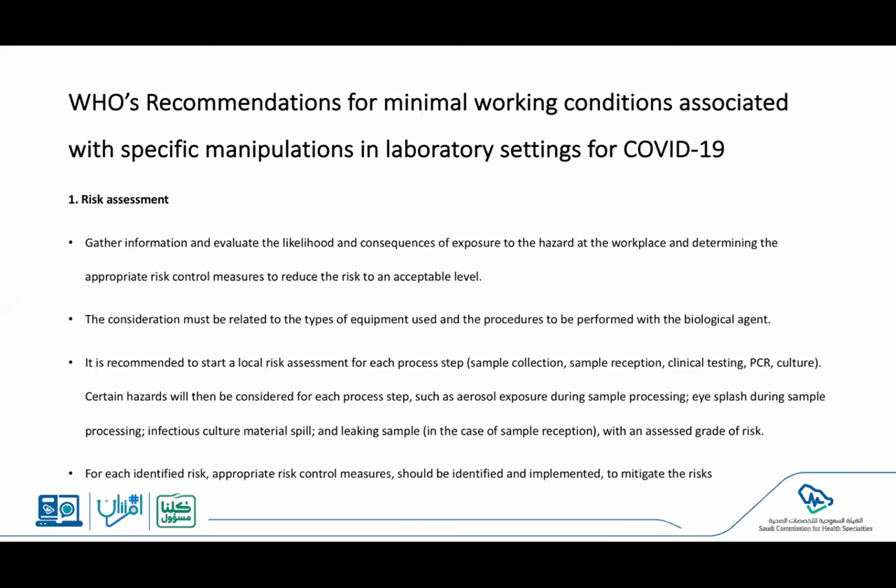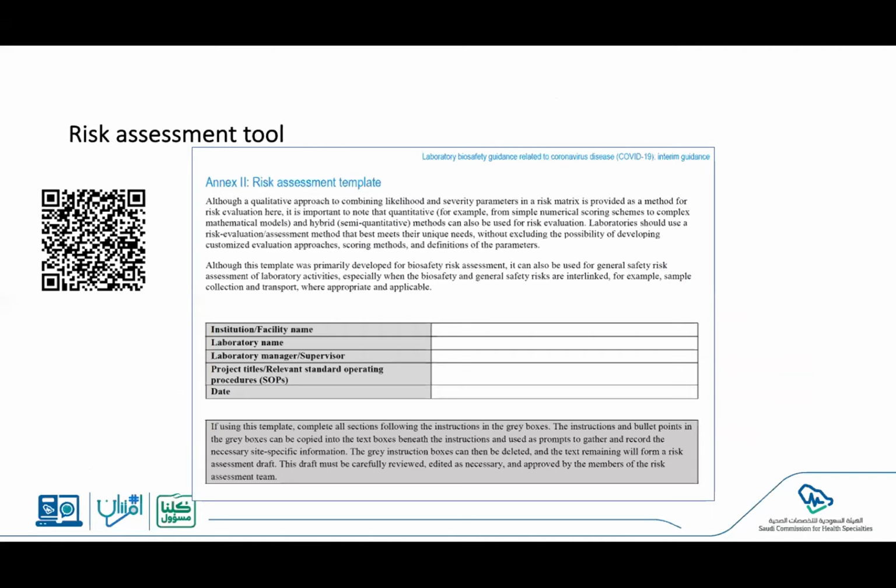The World Health Organization has put together a very nice assessment tool, which can actually go through each of those steps in detail, as well as go through the different steps and equipment that you might utilize. And again, if you scan the QR code, you can actually go immediately through to the document. It's the same document as before, but it's actually in the appendix of that document. You can see the full risk assessment template.